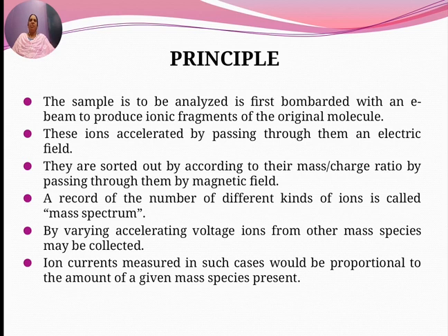Coming to the principle. The principle of operation of this mass spectrometer is, the sample which is to be analyzed is first bombarded with an electron beam to produce ionic fragments of the original molecule.